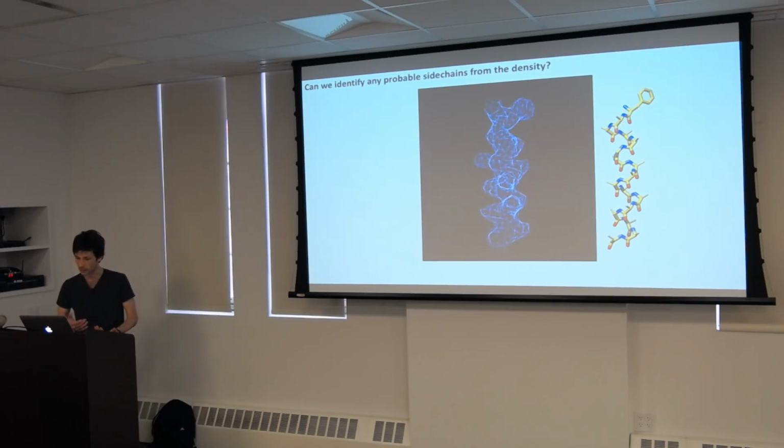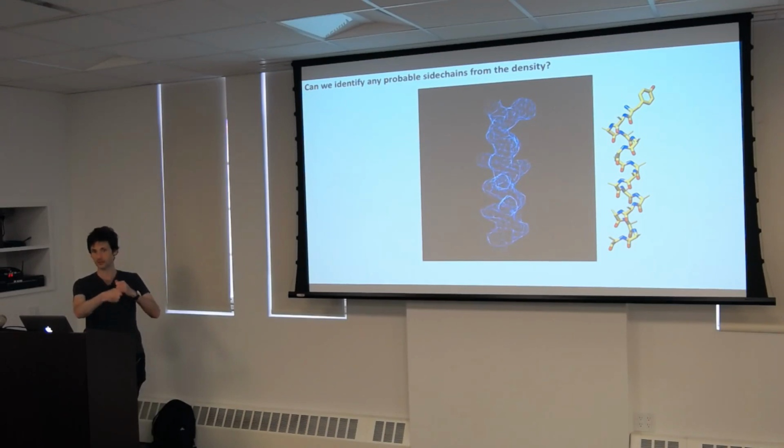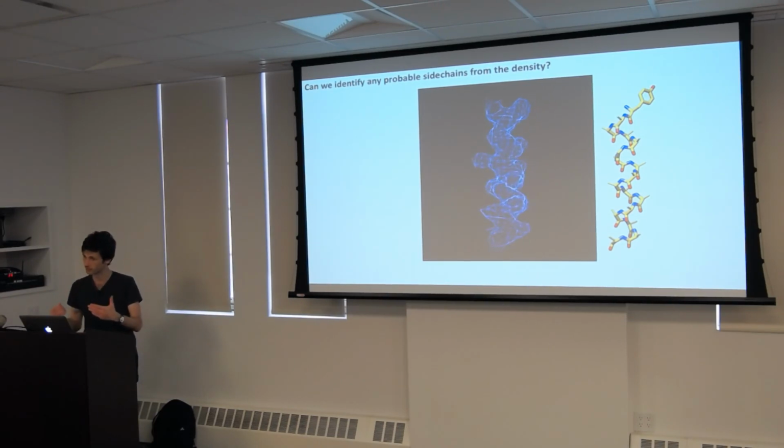So we could start by trying to see, is it a phenylalanine? Is it a tyrosine? Could be either. We really have to test different patterns in the sequence that match this density, and then see if, by extending the sequence, the results that we get are consistent.